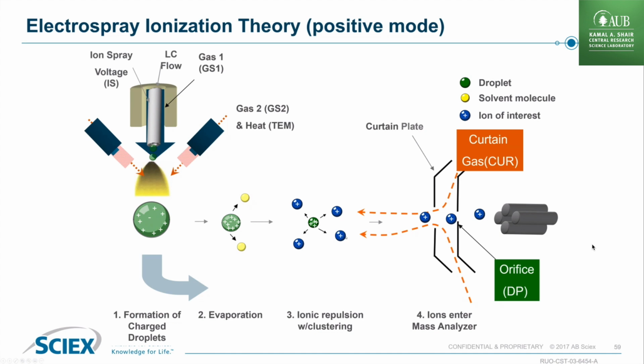And this is how we create what's called a gas phase ion. Right? We need the ions in the gas phase in order to get them into the instrument and to be able to manipulate them in the vacuum. We need to get rid of the solvent, and we need the ions. So we have two things here in the source, the creation of the gas phase ion. And now the gas phase ion can enter into the instrument. So that's how the ionization is working.